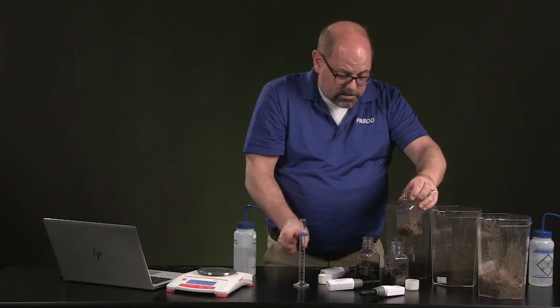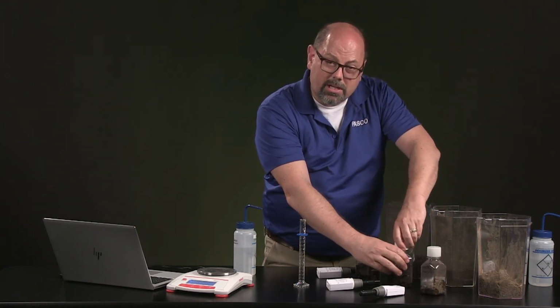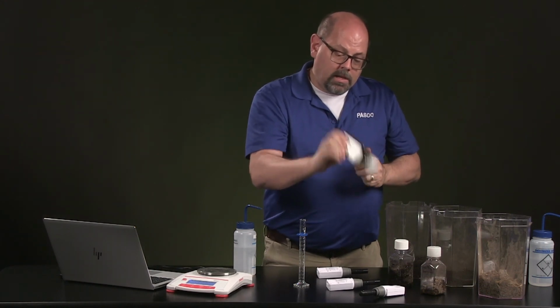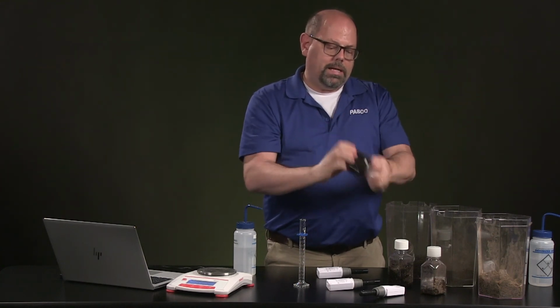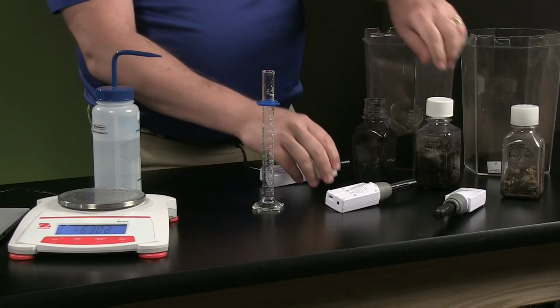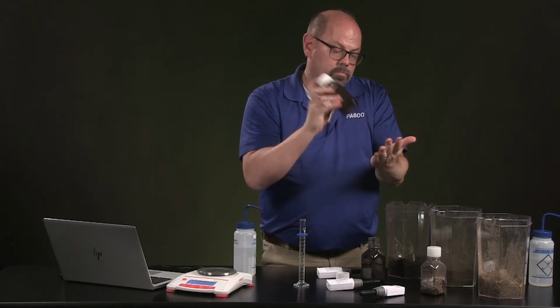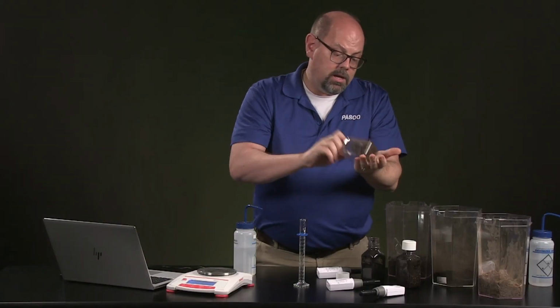Now each of these has some soil and water. I'm going to put the caps on just so I can shake them and get the water as distributed as possible through there, to encourage, if there's decomposition or bacteria or other kinds of things going on, that we can mix it as well as possible, encourage whatever, either microbes, bacteria, or even little organisms, will get equal amounts of water. Okay, that's nice and mixed. And this one, let's get this guy.